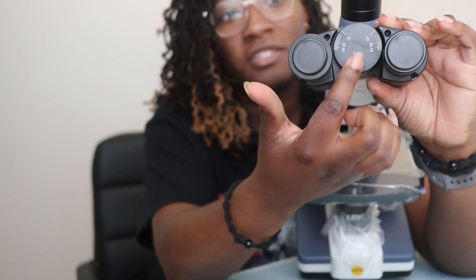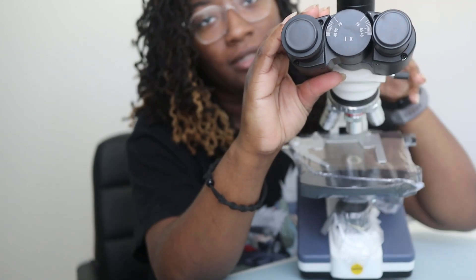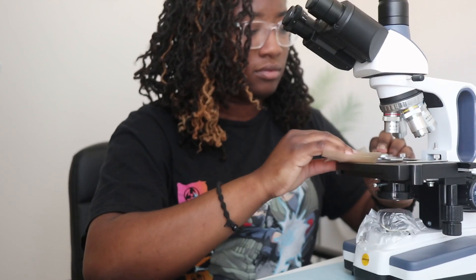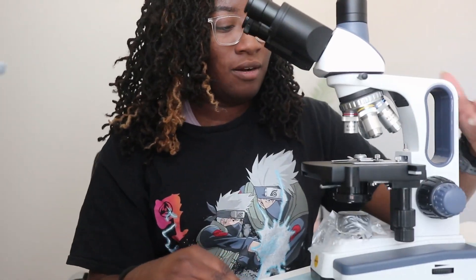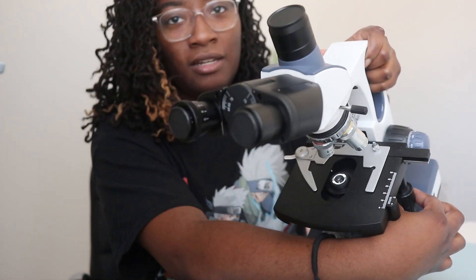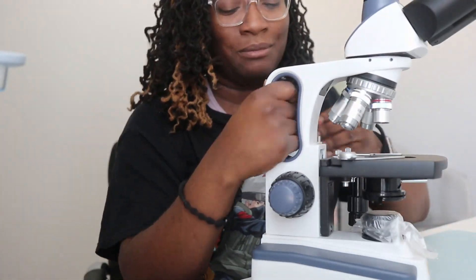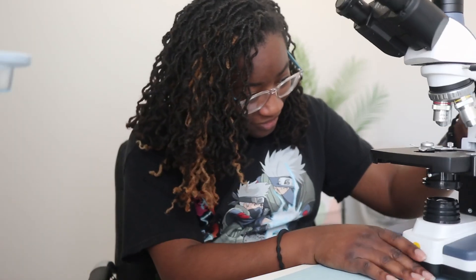The binoculars also come with a precision marker so that you can find a really good viewpoint. Let's take the wrapping off and look at the stage. One thing I really wanted on this microscope was a mechanical stage, and it already has it loaded on as well, so I don't have to put anything together. Another thing I like is this arm — I've never been able to just move a microscope so seamlessly. This is your mechanical stage on top. It's ready to use right out of the box.